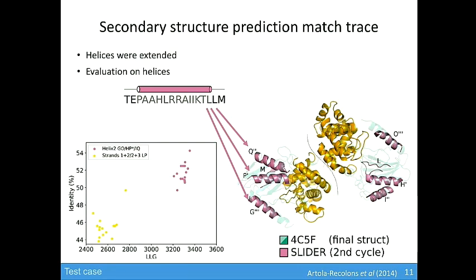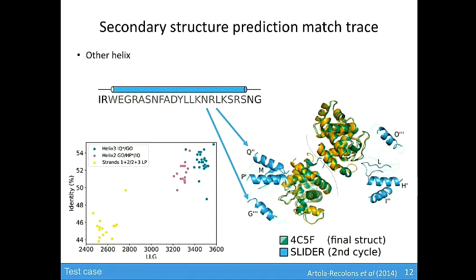So we generated the same hypothesis for both of the fragments, and this was important for the distinction of the hypothesis. And then we went further and further modeling the sidechains until the point that the electron density already revealed additional features, which could be used for other modeling software or done by hand.